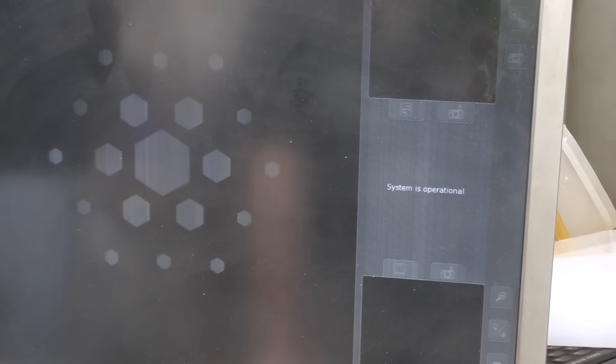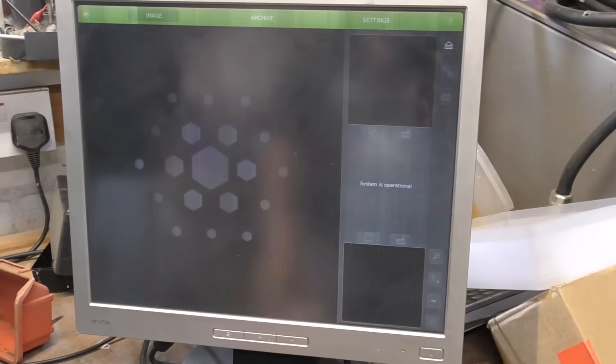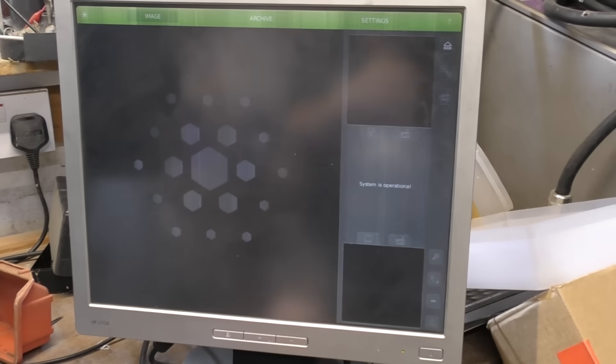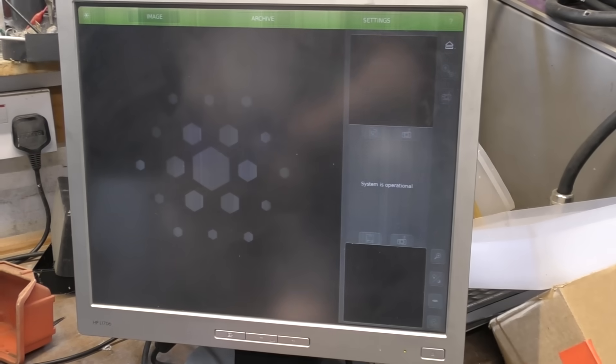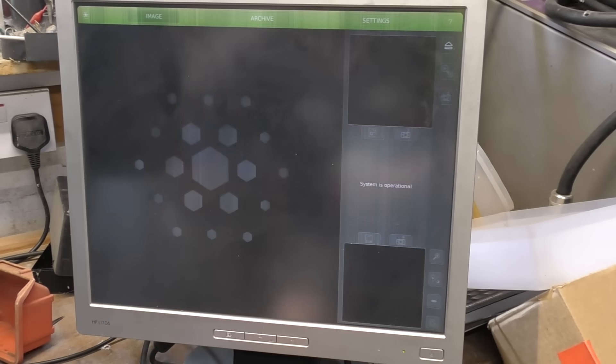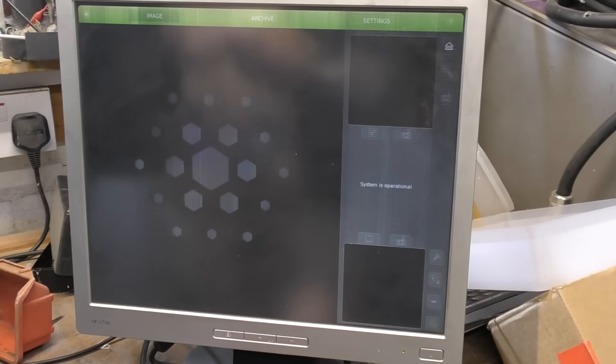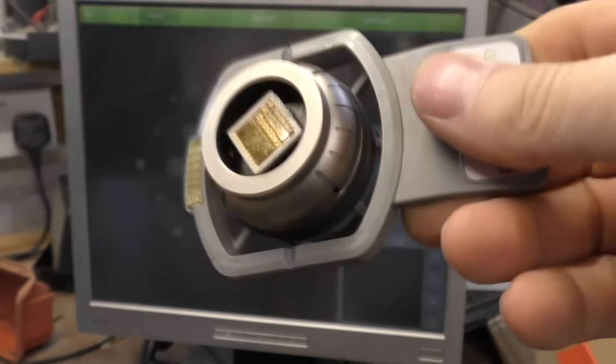I left this running overnight to put it through its 14-hour pump down cycle. Let's see what happens when we get to the end of that. We've got to the point where it says system operational. Let's stick a sample in.